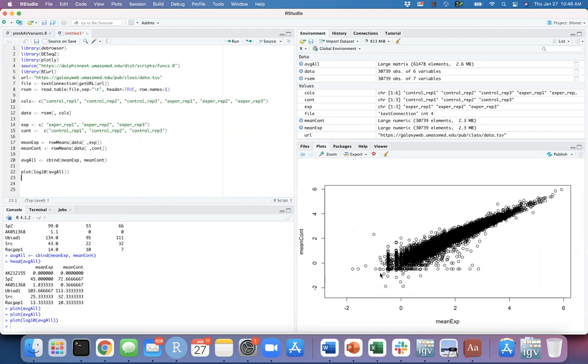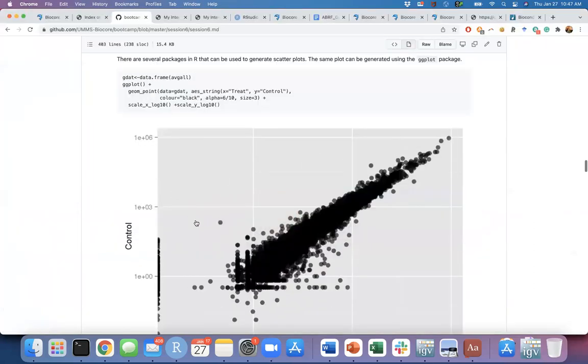When we do differential expression analysis, we're going to look at these genes and remove them from our DE analysis, because in this case, we have 30,000 genes here, but when you remove the genes close to zero, you're going to have about half of it, 15,000 genes, and this will change all the p-value and p-adjusted value calculations. That's why you need to remove all these zero genes. But how are you going to decide? It's going to come in a second. But let's do this beautiful plot.